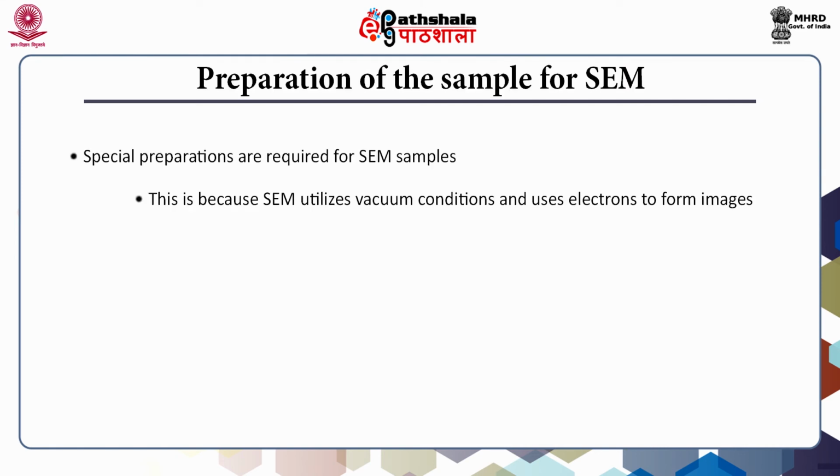Because the scanning electron microscope utilizes vacuum conditions and uses electrons to form an image, special preparation must be done for the preparation of the sample.